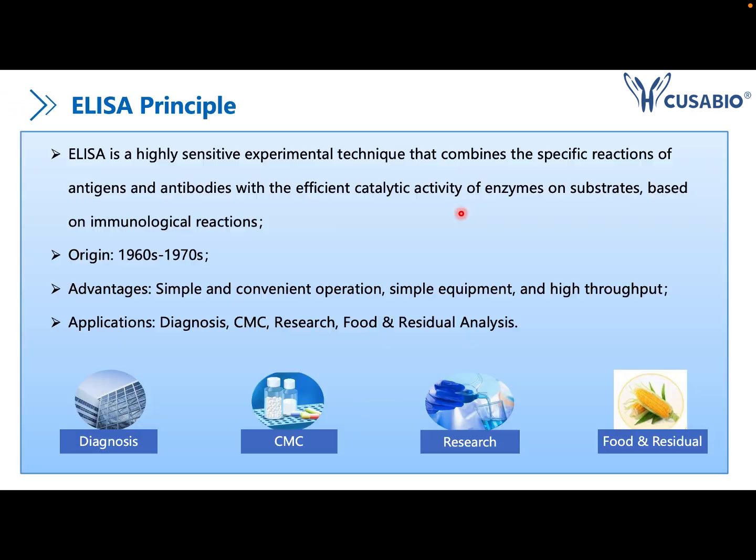Okay, so a very short introduction about ELISA. ELISA is a highly sensitive experimental technique. It combines the specific reaction of antigens and antibodies. It highly relies on the efficient catalytic activity of enzymes on the substrate. The advantages of ELISA are actually many.